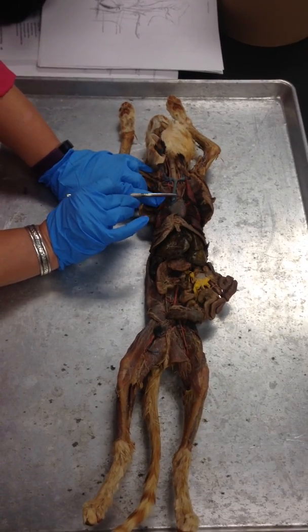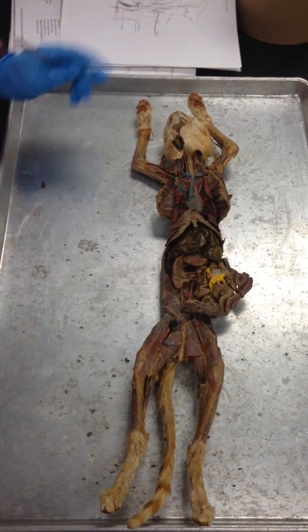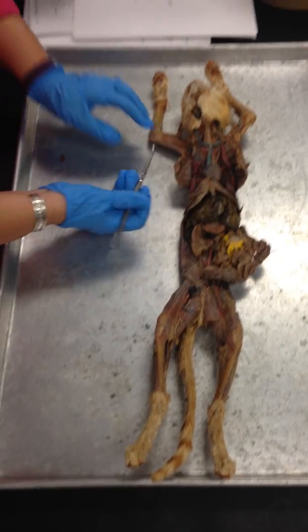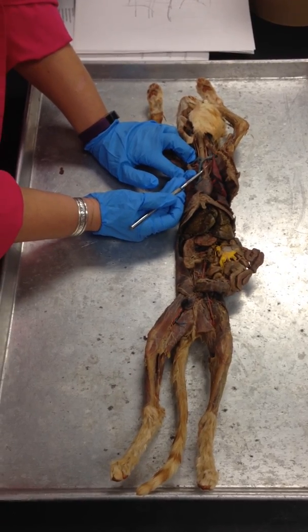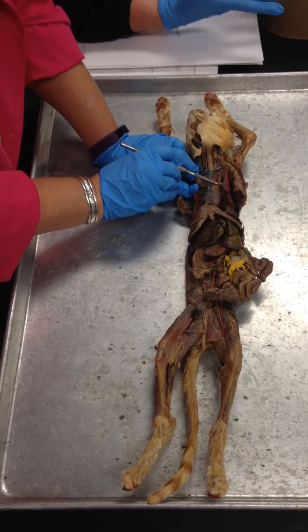Your heart, the first part is the arch of the aorta, okay? And then remember, this is the right side of the cat, and this is the left side of the cat. So when you're laying like this, that's the side it's on, okay? So this is the right, this is the left. Coming towards the right, this big fat one right here is the brachiocephalic, okay? And then this coming off of the heart is the left subclavian, okay?